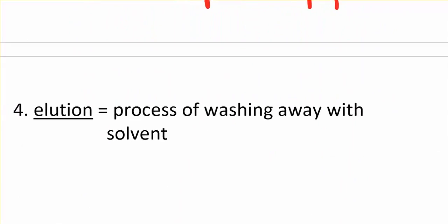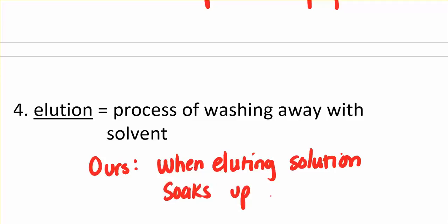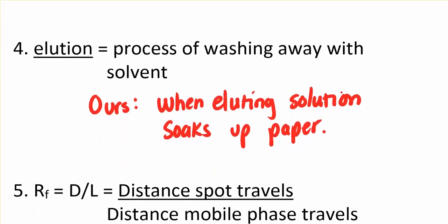Elution is the process of washing away with solvent. So we will be doing elution or performing elution when we leave our paper sitting in our solution and it slowly soaks up the paper. We'll look at that in just a second a little bit more.